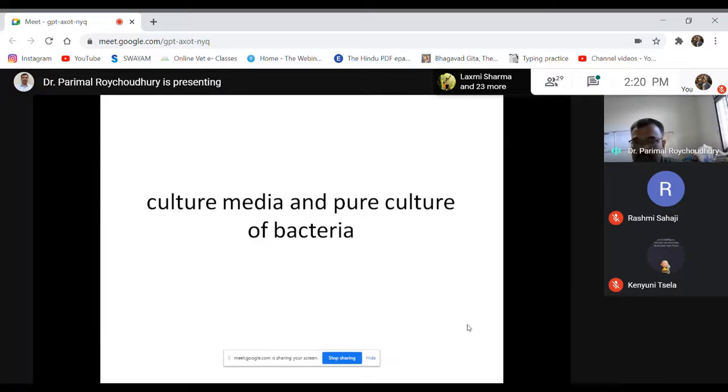In today's class, what I'm going to highlight is how we can propagate organisms. This is, I feel, the most interesting and really an exciting area, through which we can propagate these small unseen organisms and study them. We can enlarge their population to million folds, study their behavior, and crack the logic behind how they can be associated with disease conditions.